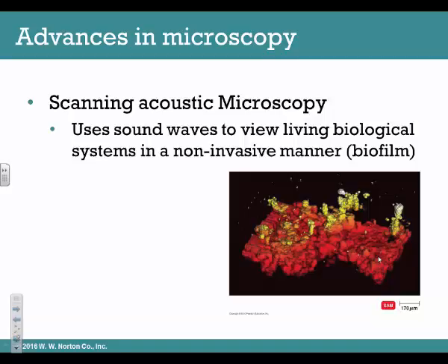Finally, I just wanted to touch upon a new form of microscopy called scanning acoustic microscopy, which uses sound waves instead of an electron beam to study living biological systems. This is really useful for understanding biofilm, which is a community of bacteria and a particularly challenging problem when associated with infection.